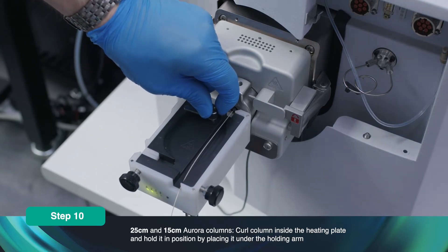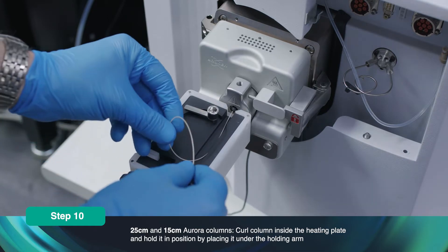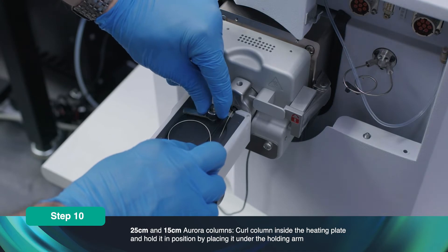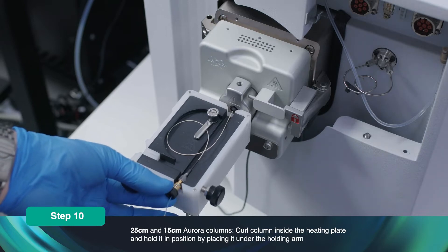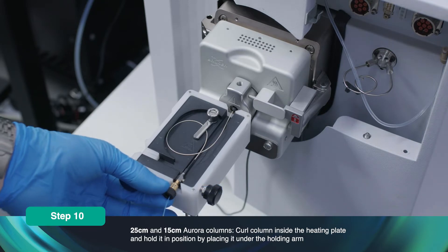For 25cm and 15cm Aurora columns, curl the column inside the heating plate and hold it in position by placing it under the holding arm. Tighten the earth screw onto the Nano Zero to ensure that the Nano Zero is grounded and held in position.